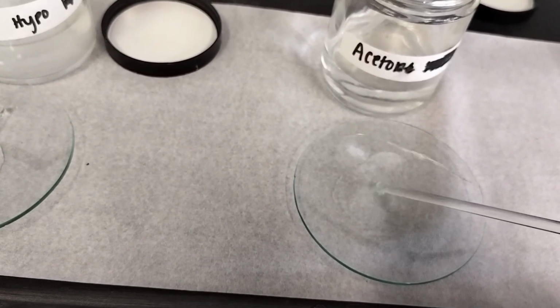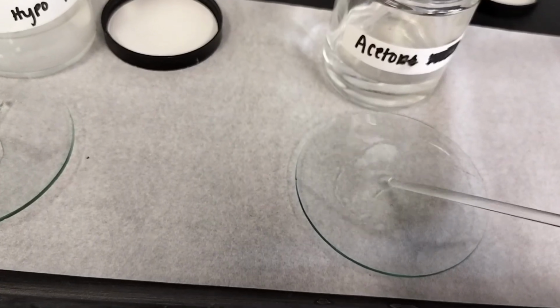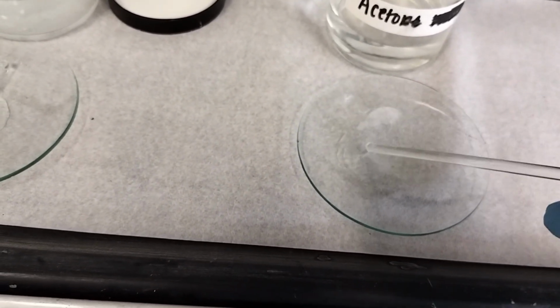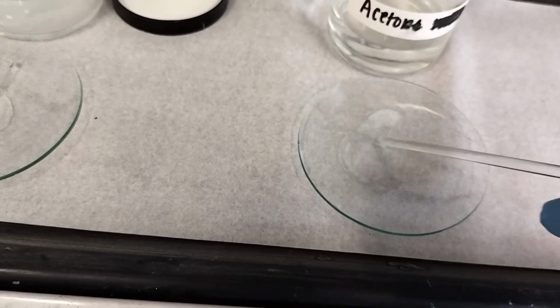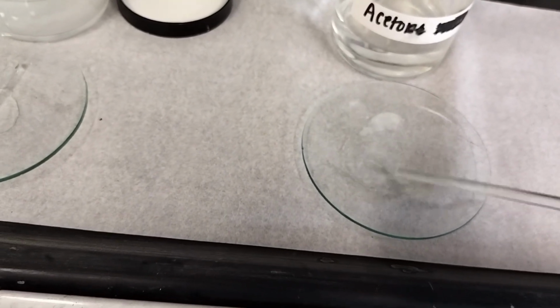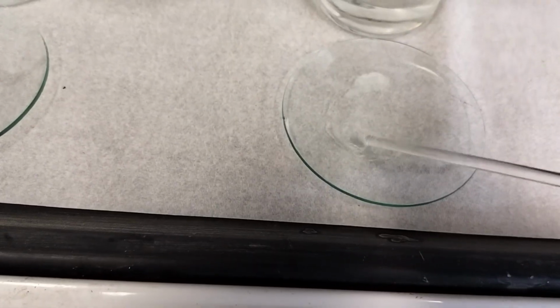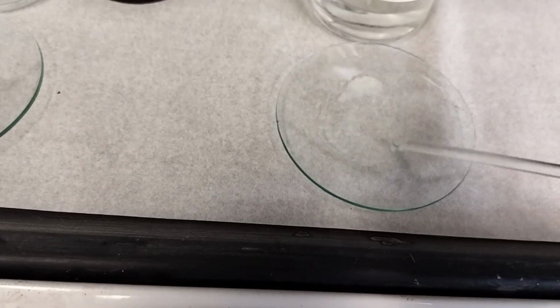After waiting a few minutes, we can see that the fiber did not dissolve in acetone. This confirms that the sample is not acetate. So we will proceed to the next chemical test.